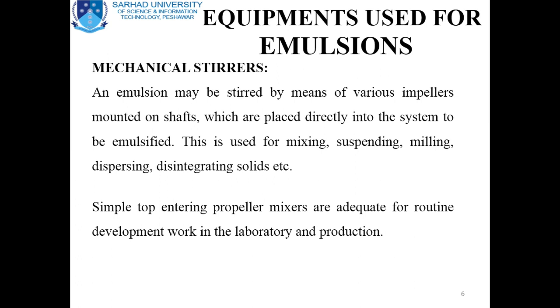But remember that simple top entering propellers, which enter from the top side as the mixing device, are sufficient for routine development work in the laboratory as well as in production. Laboratory means the small scale development of the formulation, which is part of R&D, research and development.